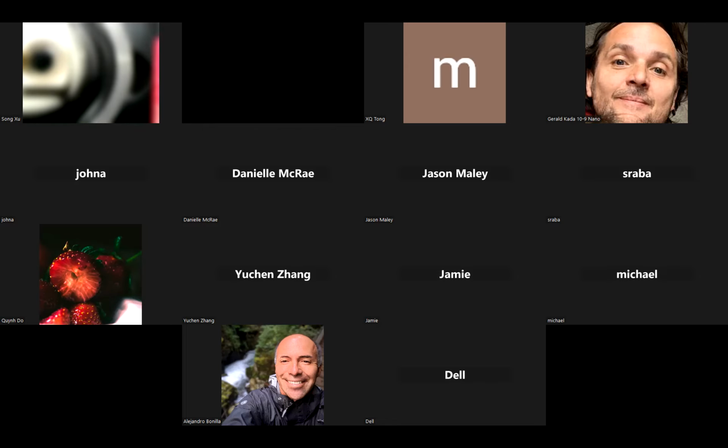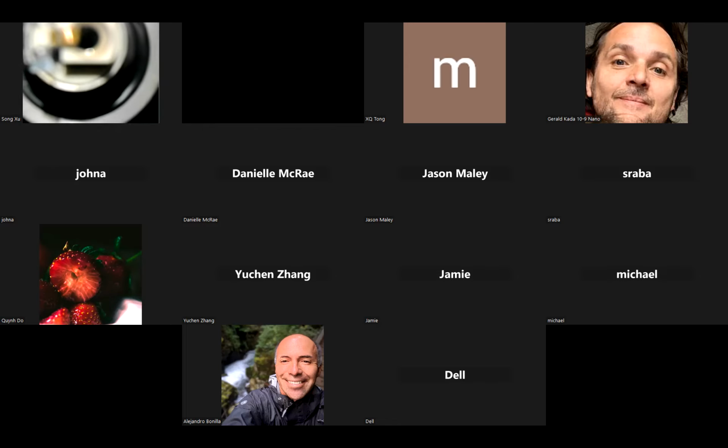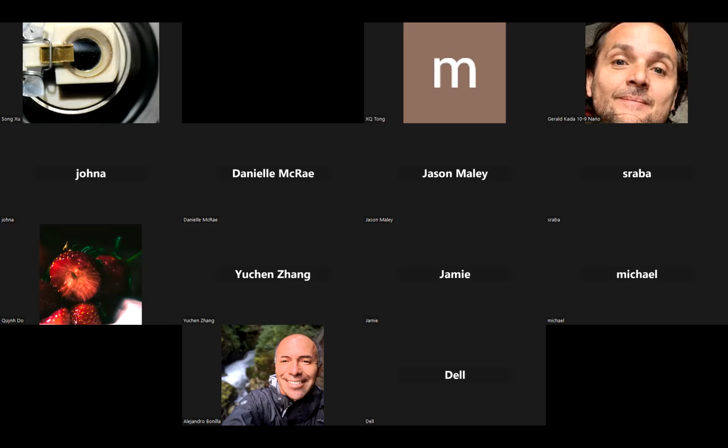I'll try to show you this, but it became blurry now. Okay, background. So yes, when you do STM, the biggest enemy you're fighting is drift. There you go. It's coming.